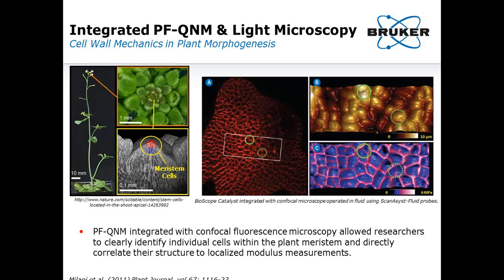This type of study illustrates the potential of PeakForce QNM to investigate the mechanical changes of plant cell walls during normal development, as well as in the presence of hormones, drugs, or potentially in a modified genetic background.